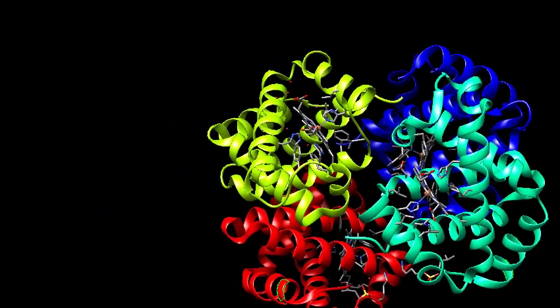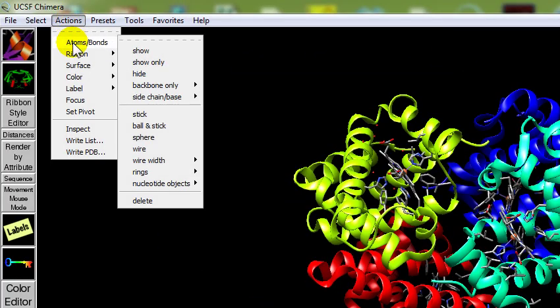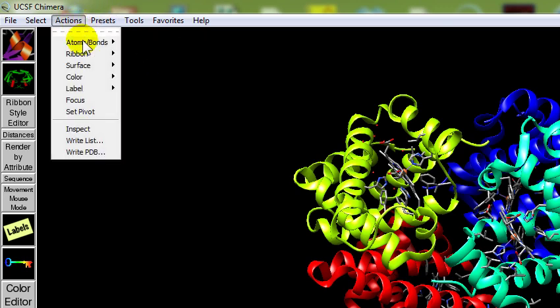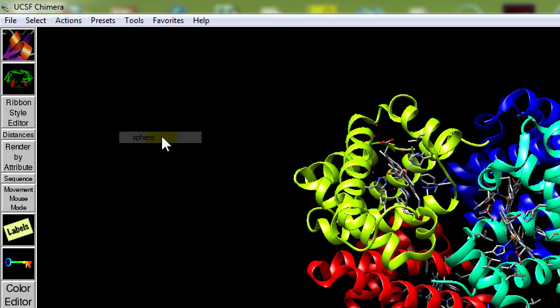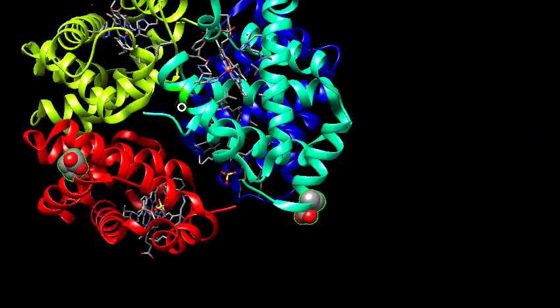Now I'm going to go to actions, atoms and bonds, show. Now they're there. I'm going to go to atoms and bonds and ask for spheres. There are the spheres, so now you can easily see those two positions with the glutamic acids on them.